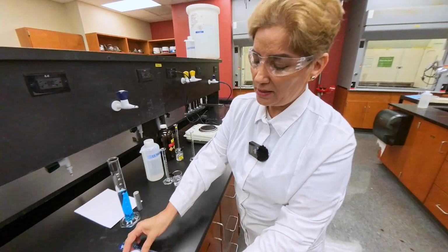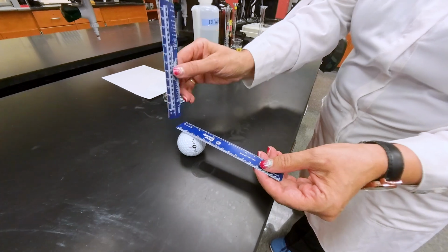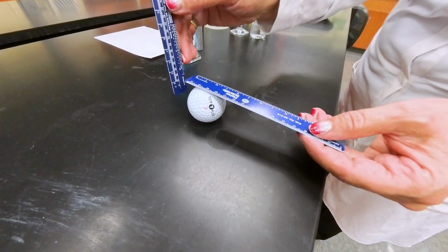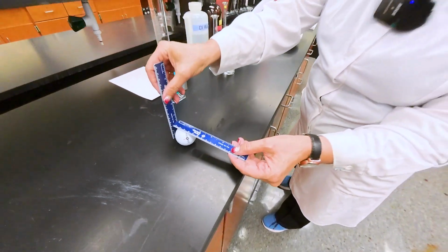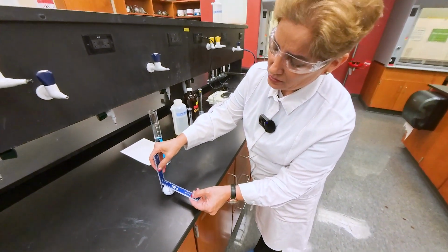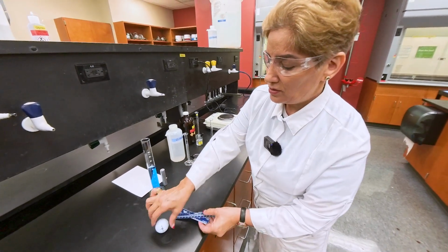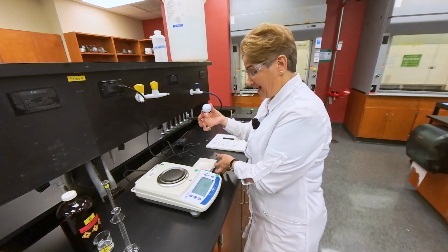So we already did this measurement once. We know how to do the measurement for the diameter of the golf ball. And then we divide that by 2 to get the radius. Then we are going to measure the mass.